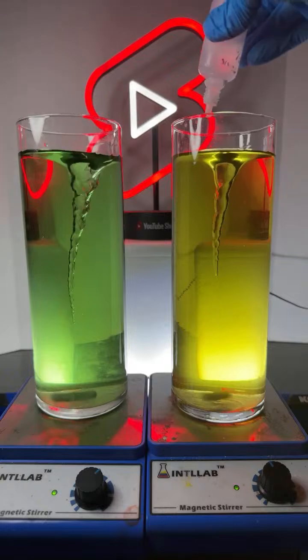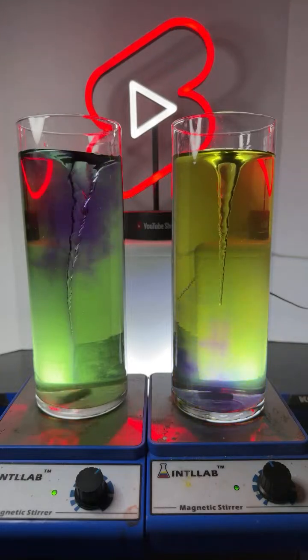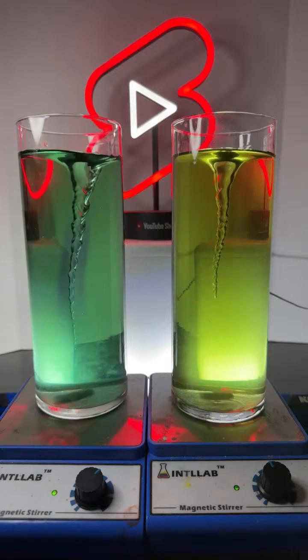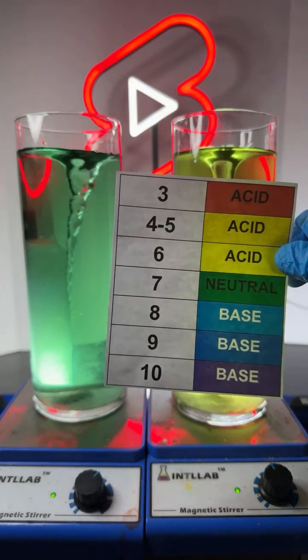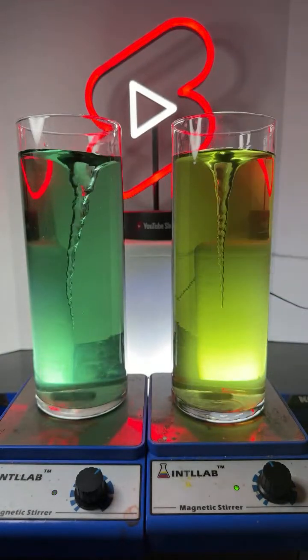So what I've got right here are two flasks with some universal indicator in them. Universal indicator is also known as rainbow indicator. It displays these colors depending upon pH. So right now, this has a pH of 7. This has a pH of 6 or so. And I just add acid or base to change the colors.